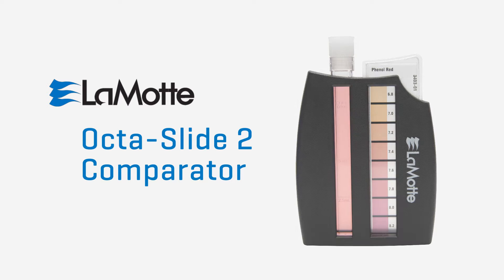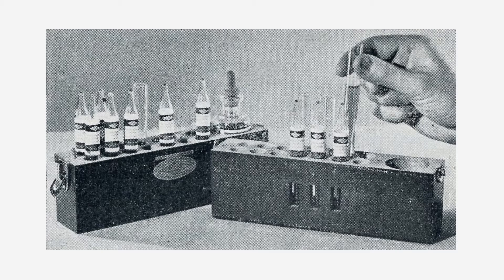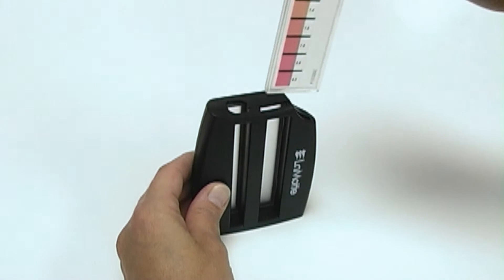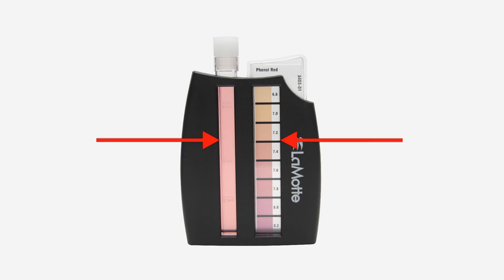The LaMotte Company Octaslide II Comparator, designed to simplify precise water analysis. In 1919, LaMotte Company developed one of the first portable comparators in America for determining pH in water. With the top-loaded bar, the design of the new Octaslide II Comparator places the test reactions side-by-side with all eight color standards at one time.